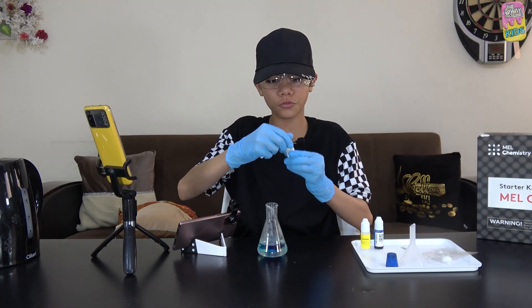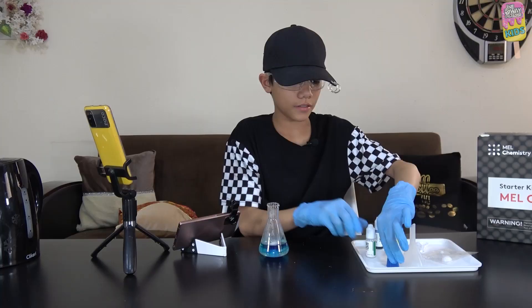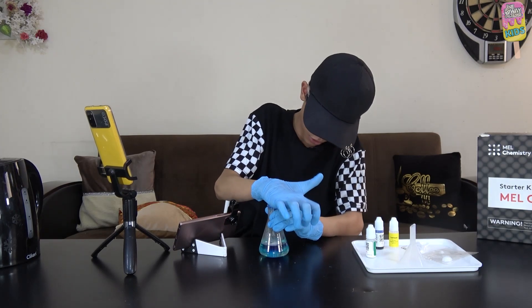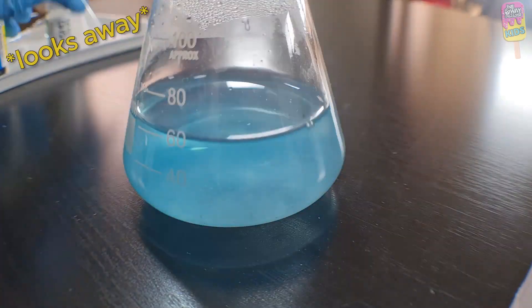Now I'll add two small spoonfuls of calcium hydroxide — one and two. Then I'll close the flask with the rubber stopper and swirl it gently to mix the solution.